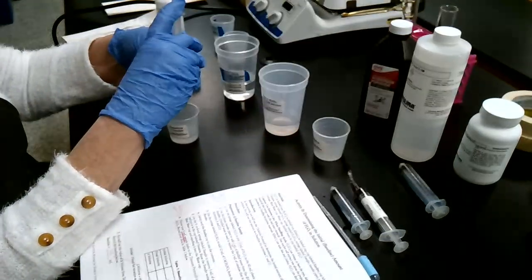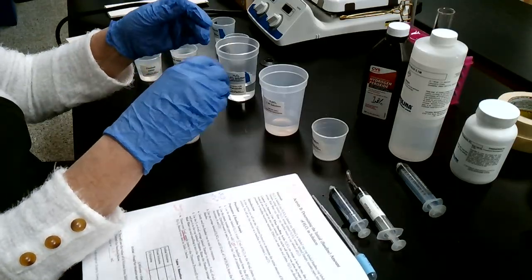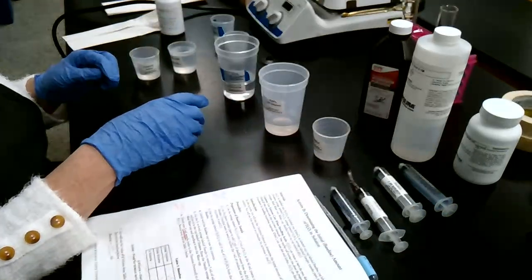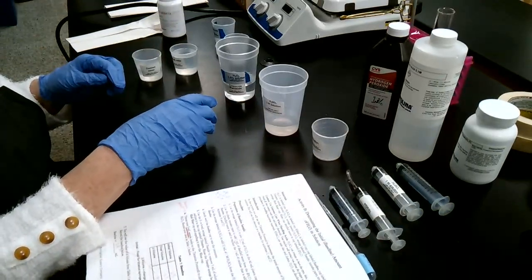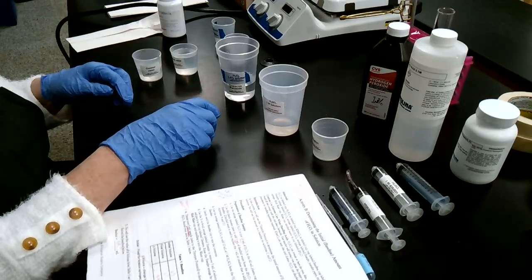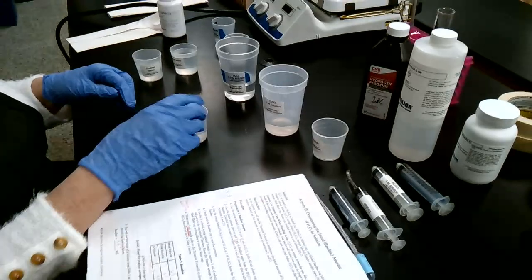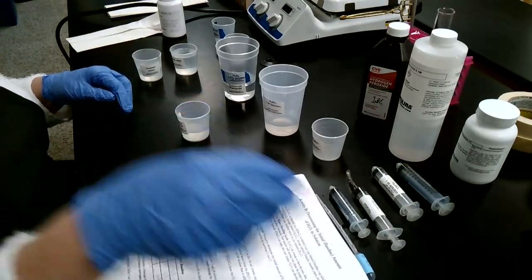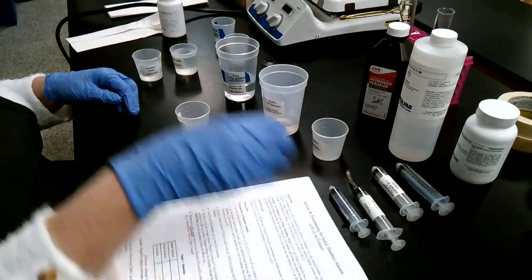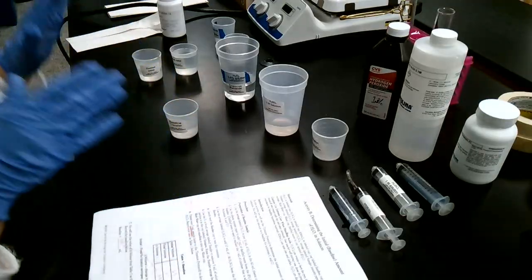So now I'm going to kill it. I always say the acid kills it. So I squirt the acid in. And when you do this in your experiments, I'm going to set that carefully here, you're going to swirl that around to make sure. Be careful when you swirl it that you don't swirl it so much that you end up spilling it. You can also use your stir rod to stir it around. Don't use any of the transfer pipettes or anything like that, because that would contaminate them. You want to use those things only for what they say.